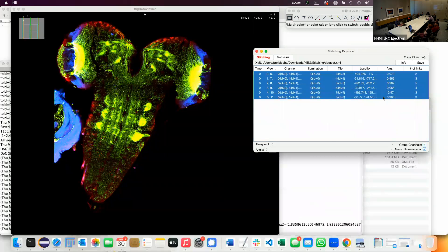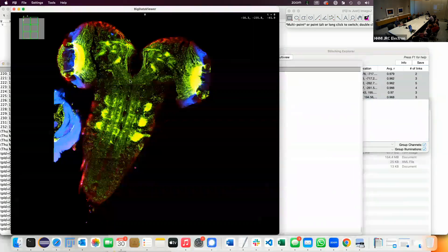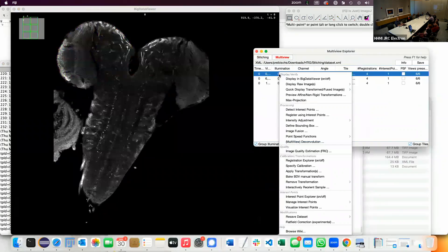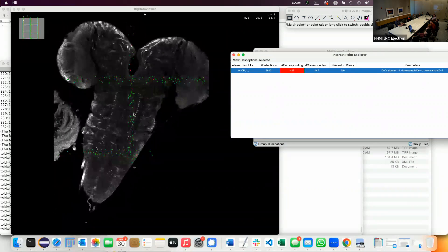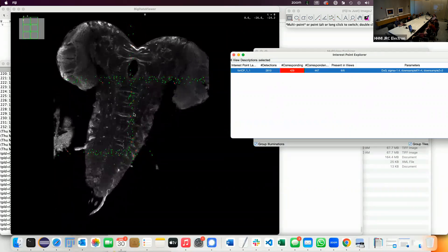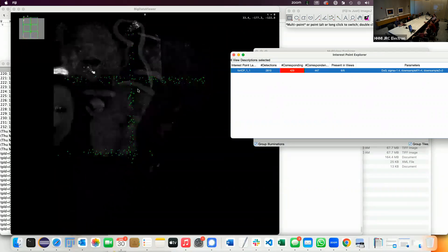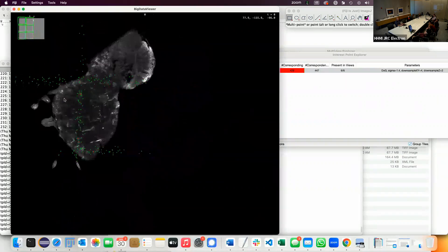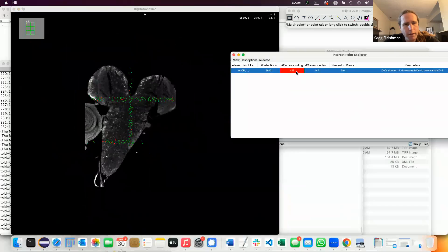It automatically extracts interest points — we can see this running in the background. It optimizes and applies. If you switch to the interest point explorer you can actually see which points it found to be overlapping and which it used to refine the registration. You can also look at all points found versus the ones actually used.